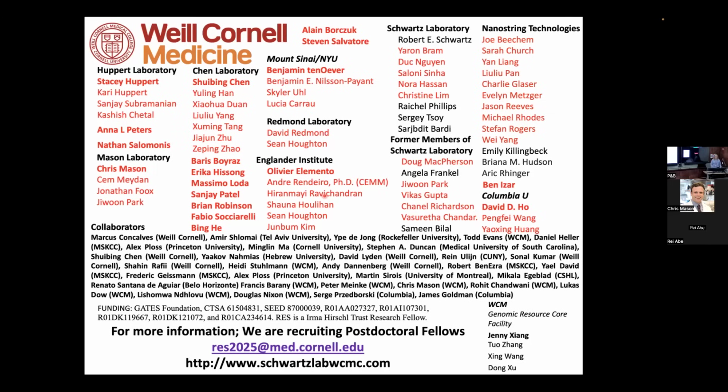Some of the technologies, though, you just label the whole slide, and the acquisition is, I don't want to use the word virtually free. And so you get a lot of cells and a lot of surface area in that. Now, I think you have a second question there, which is, there's also a computational cost here and time involved. And so how many cells, how much tissue do you need to acquire?